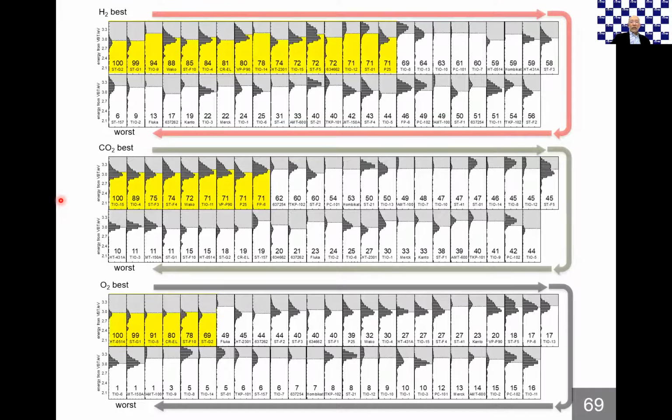However, for the carbon dioxide and oxygen evolution cases, the higher photocatalytic activity samples, with relative activity higher than 70, show the similar ERDT CBB pattern. But middle or low photocatalytic activity samples don't give similarity with each other.